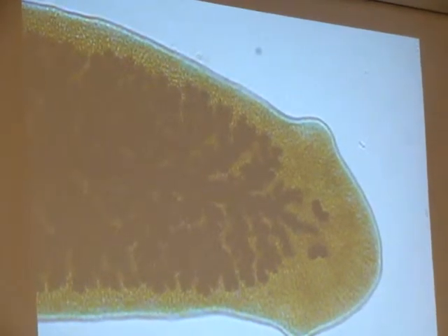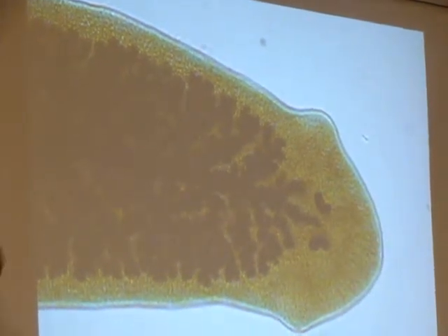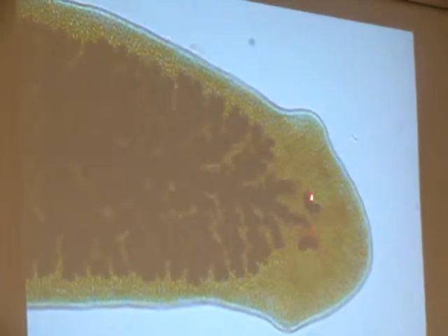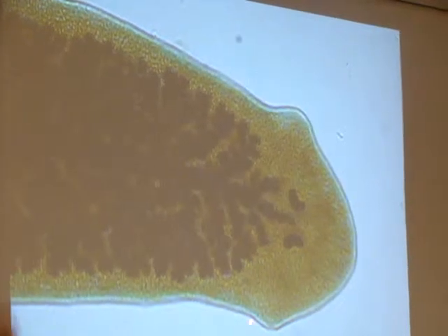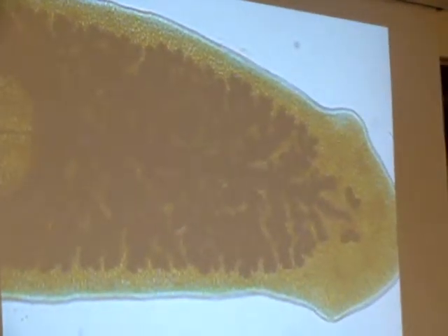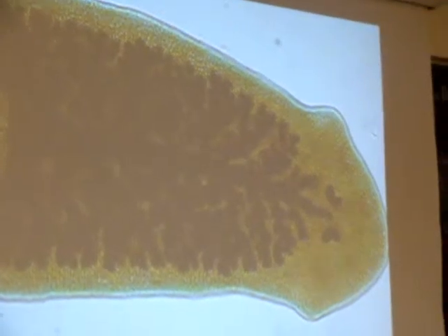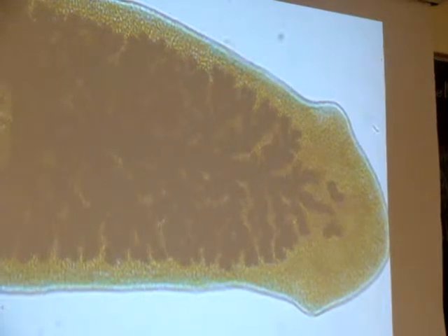Now one of the things to keep track of that might help you sort this out. This is the cute one. And so the cute one with, what are these two commas? Eyes, right? And the lumps on the thing's head? Auricles, little ears. So the cute one is Turbellaria. The other two cousins, the flukes, Trematoda, and the tapeworm Cestoda, don't have eyes. They're not cute.